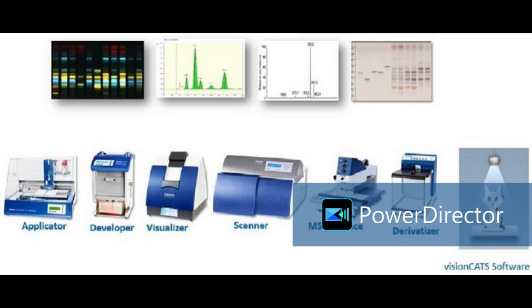Yes, ma'am. We can analyze any sample matrix. We are giving support to FDAs also, not only RFSS, Food and Drugs Administration. Here in Bandra, the Maharashtra FDA is there. They come to our lab continuously for double confirmation of their results. They have 3 HPTLC systems. In the case of honey, there is a lot of adulteration with sugars, table sugar or jaggery. So it is easy to detect. Mostly table sugar is sucrose. If the amount of sucrose is more than 5% in any honey, that is not acceptable.